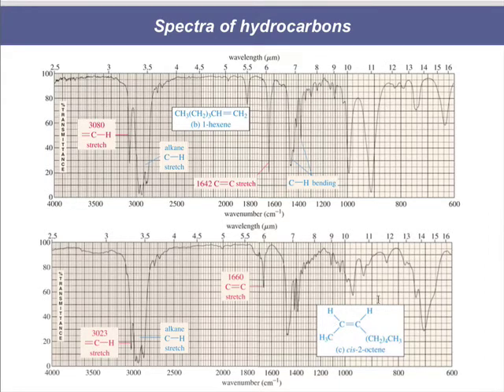These sp2 hybridized carbon-hydrogen bonds showing up at 3000, a little bit over 3000. 3020 versus 3080, but you can see that these are really similar. The vibrations might be slightly stronger or slightly weaker. For example, the carbon-carbon double bond here is a stronger peak. The carbon-carbon double bond here is a weaker peak, and they might differ by 10 or 20 wave numbers, but for the most part, all the functional groups are here.